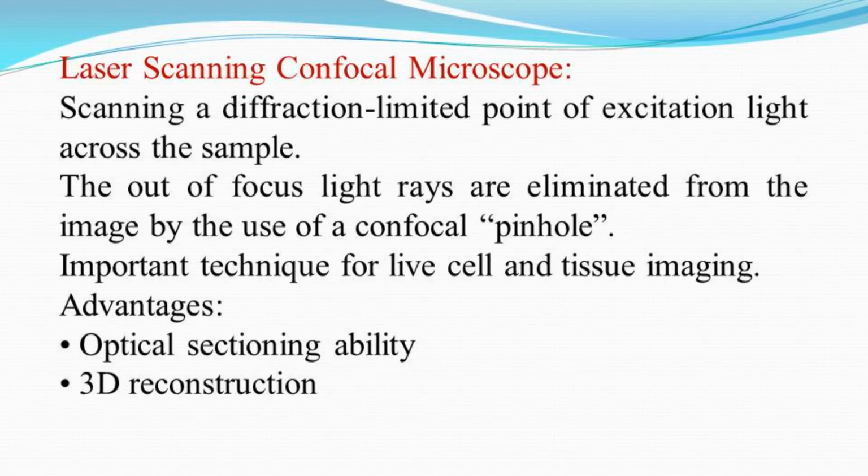Next is laser scanning confocal microscope. It scans a diffraction limited point of excitation light across the sample. The out-of-focus light rays are eliminated from the image by the use of a confocal pinhole. It is an important technique for live cell and tissue imaging.